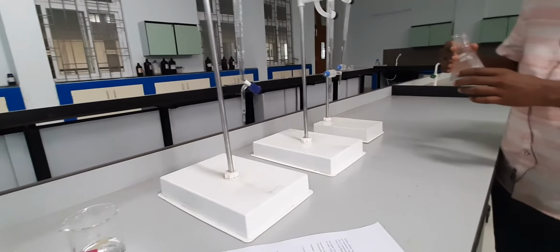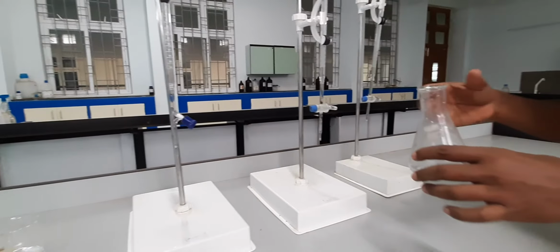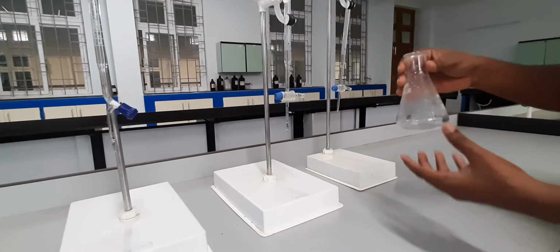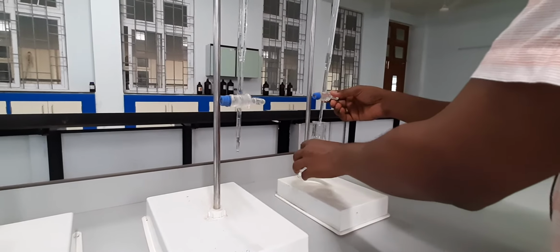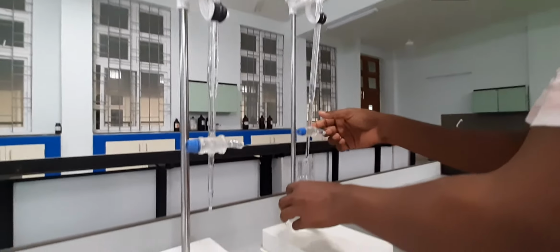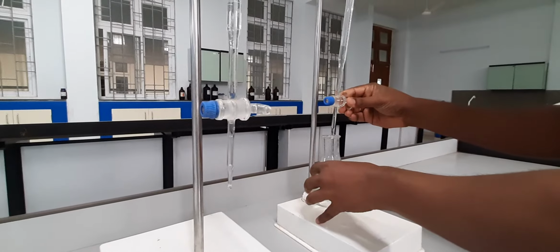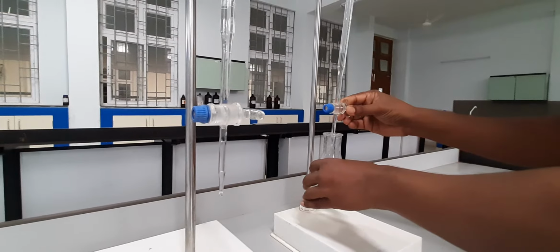In a normal experiment you are recommended to use a dried conical flask, but however I am showing in a conical flask which is not properly cleaned or which has some other liquid as well. Anyway, that is not a big issue in this case because we are going to add water. So this is the chloroform and I am going to add 10 ml of chloroform. This is also a 25 ml burette. So again I am going to dispense 10 ml of chloroform.